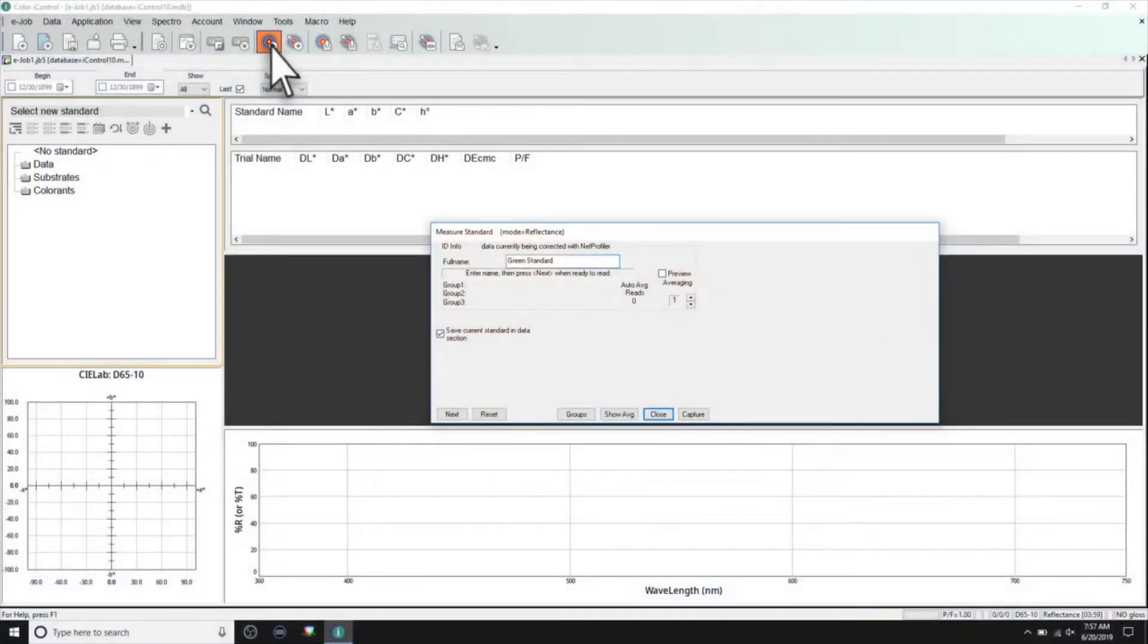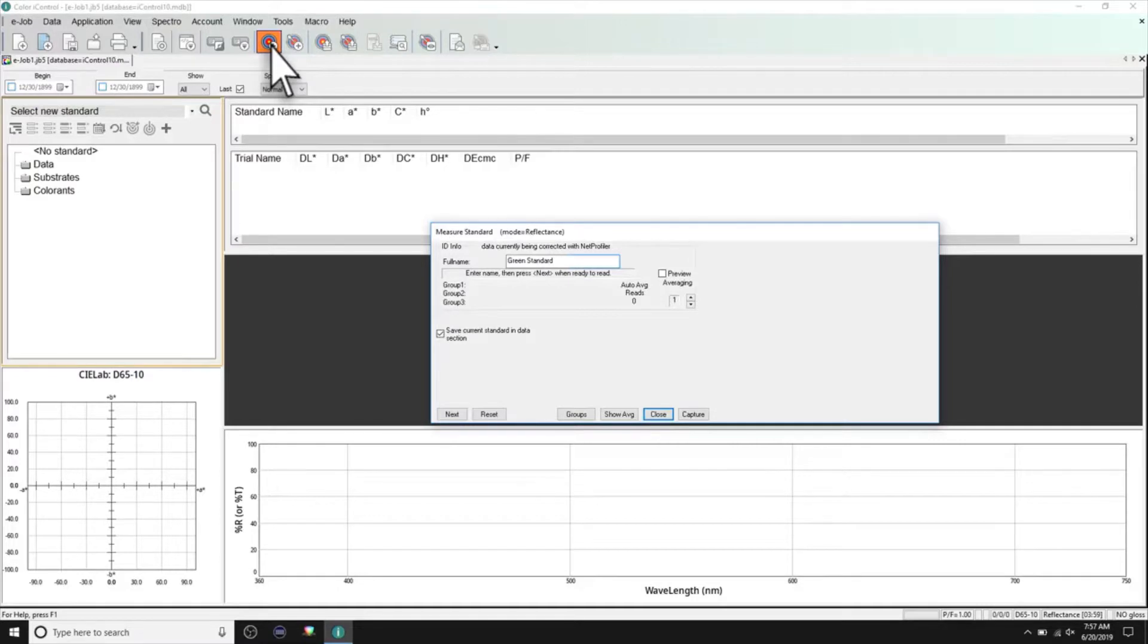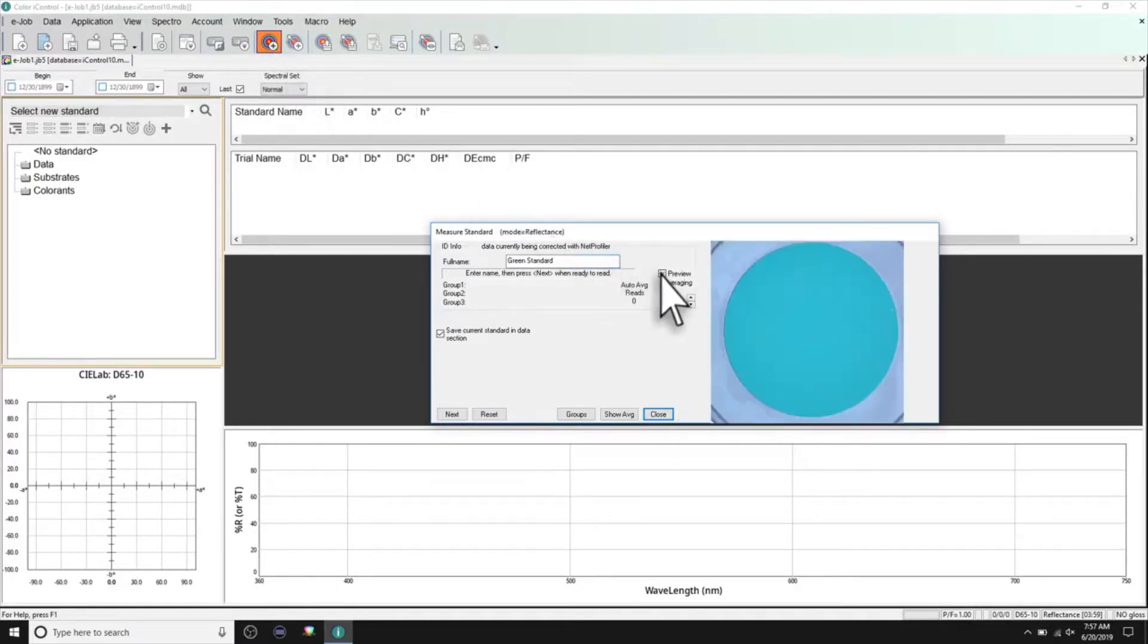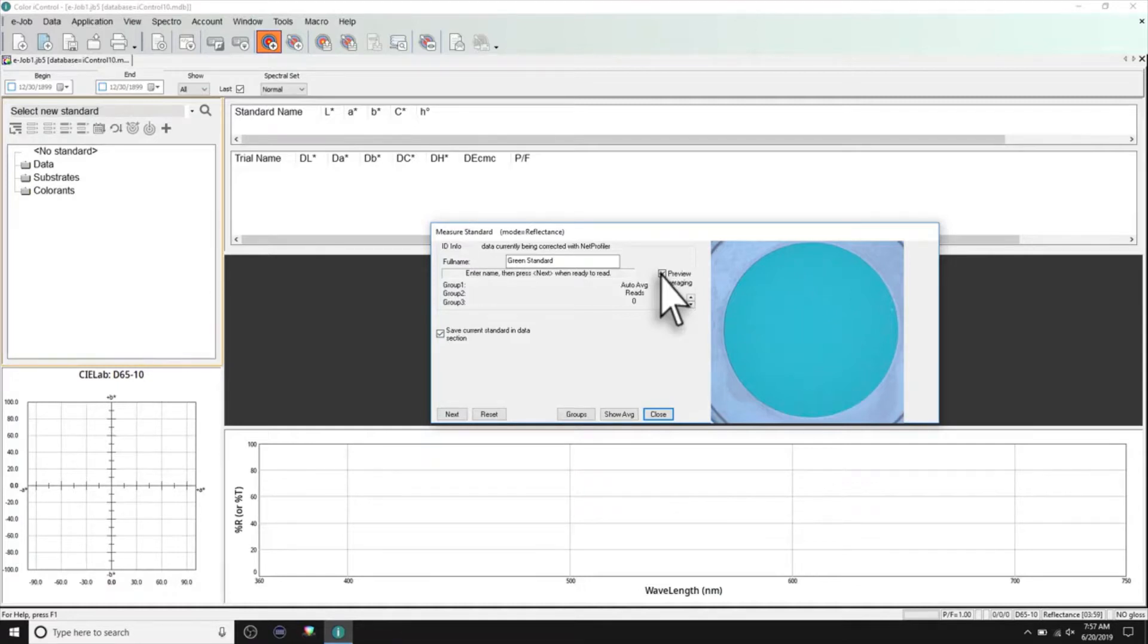In Color IQC or Color iMatch, you can turn on the camera to help you position your sample and to ensure there is not a contaminant in the area being measured.